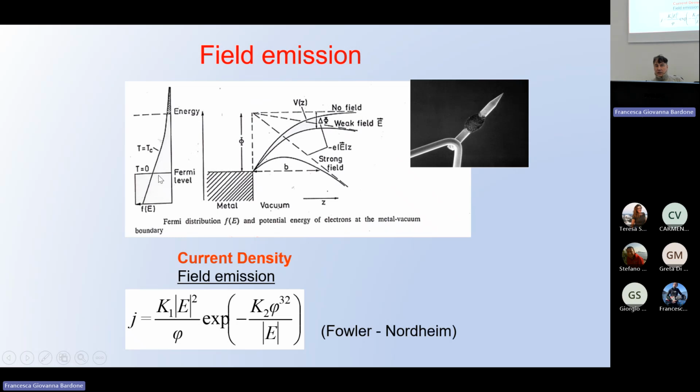If you calculate the energy distribution of electrons in a metal, you know that at zero Kelvin, all the electrons have bound states which are inside the metal. But if you change the temperature a little bit, you have some amount of electrons which have energy to rise up over the barrier that prevents electrons escaping from the surface of solids.